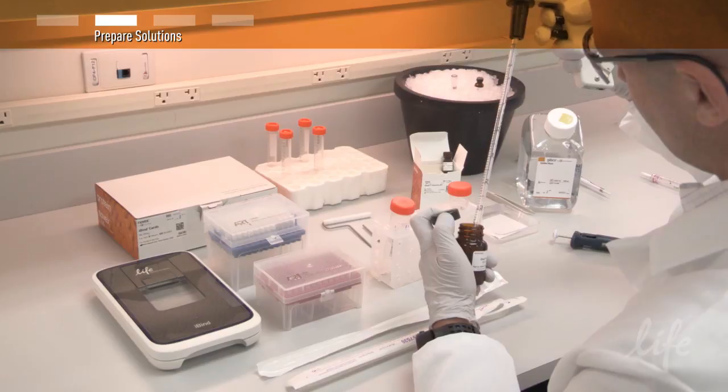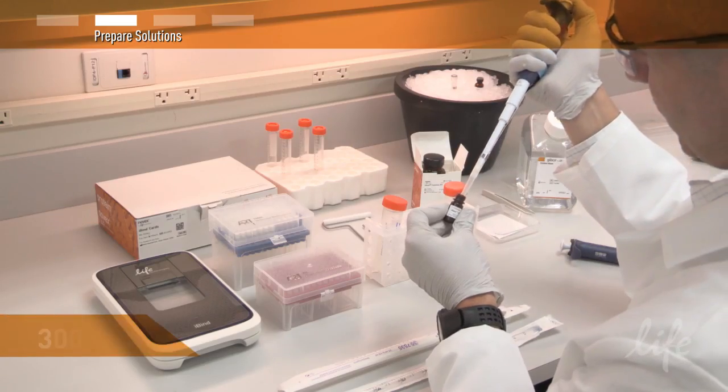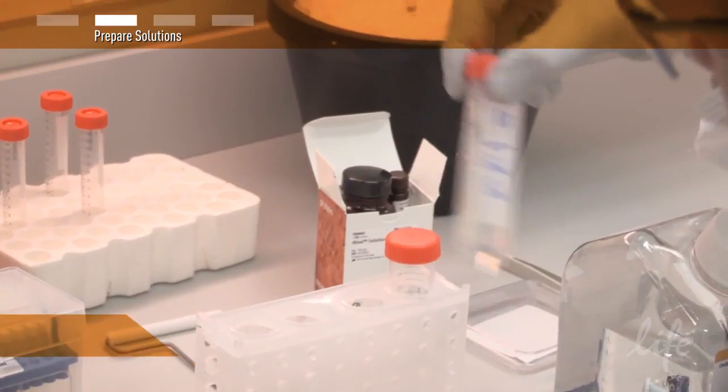Then add 6 milliliters of the iBind buffer, followed by 300 microliters of the iBind additive. Then swirl to mix.